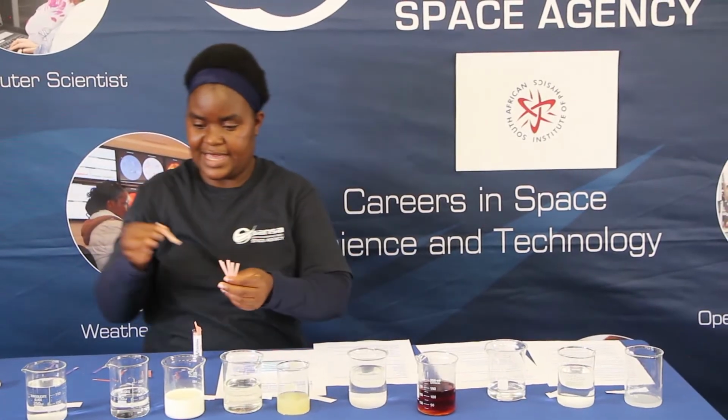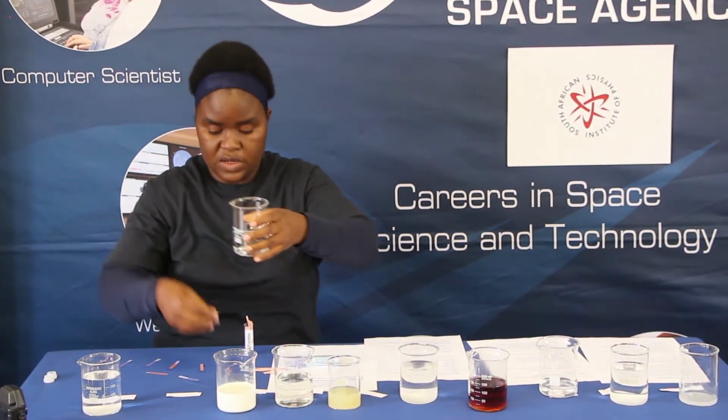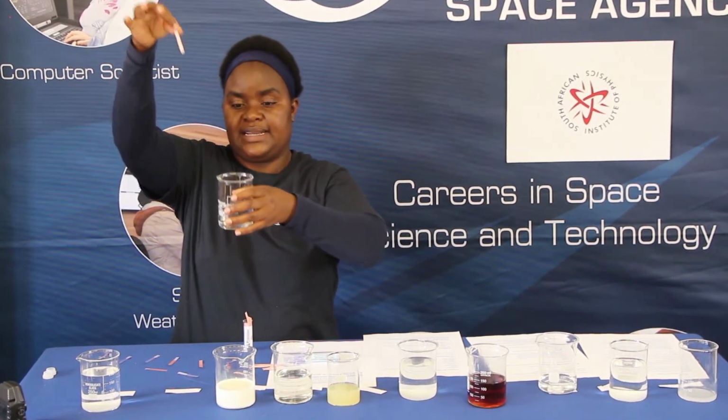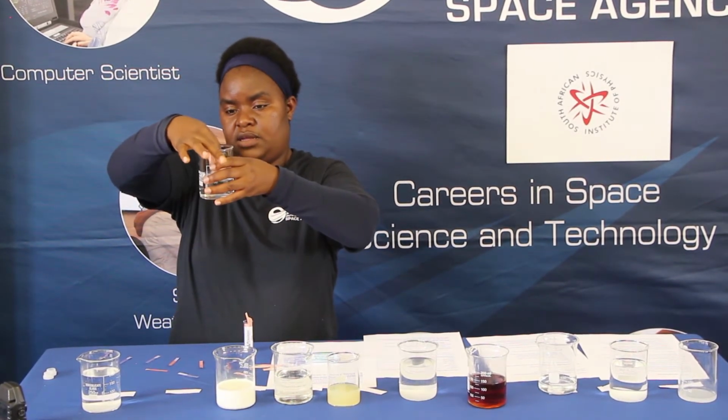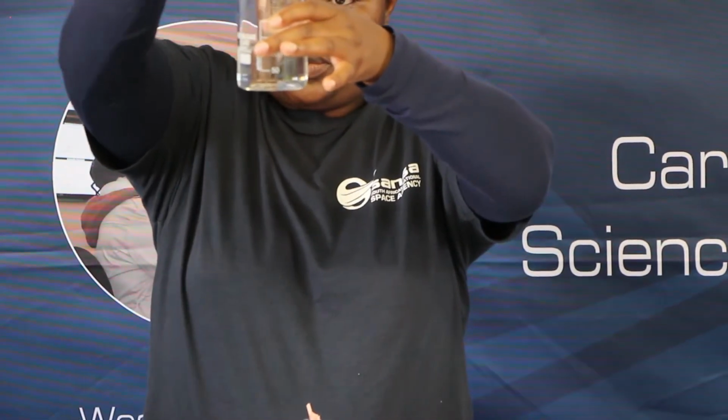Can you remember which one is the water solution out of these ones? Oh, so which means you were sleeping. Okay. This is our water solution. Observe what happens if I put the red litmus paper in there. Can you see? It's water. There's no color change there. It remains the same, red.